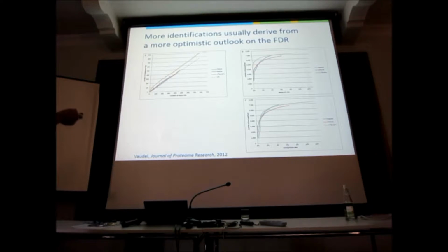So these are the target hits. At 1% FDR, whoa, I want Tandem. It gives me 6,200 hits instead of 5,000. It must be amazing. Yeah? This is what you now see. And interestingly, Mascot and OMSSA are very similar.